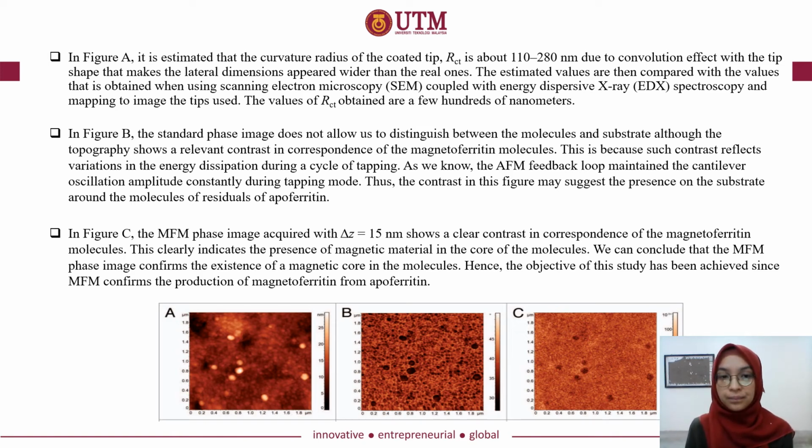In Figure B, the standard phase image does not allow us to distinguish between the molecules and substrate, although the topography shows a relevant contrast in correspondence of the magnetoferritin molecules. Why does this happen? This is because such contrast reflects variations in the energy dissipation during a cycle of tapping.